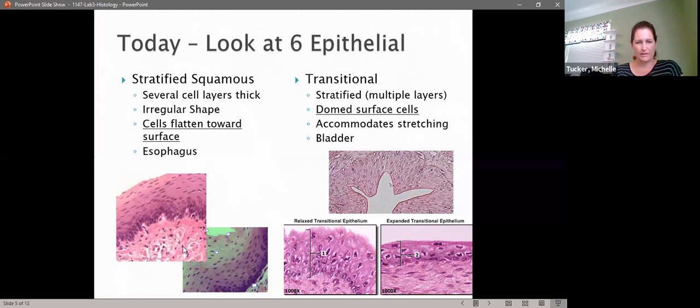This down here is dermis, connective tissue at the bottom. Here is the basement membrane with the dark, round nuclei, and then you have layers above it. In the layers above it, the nuclei have flattened out, and everything starts looking very squished.